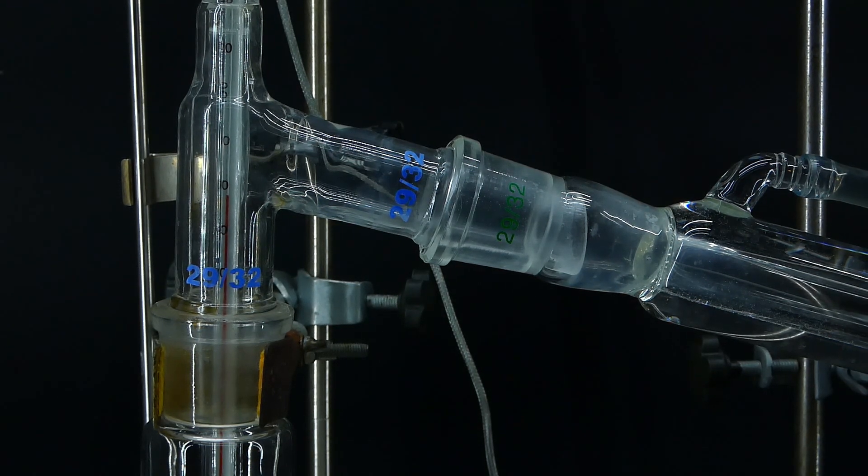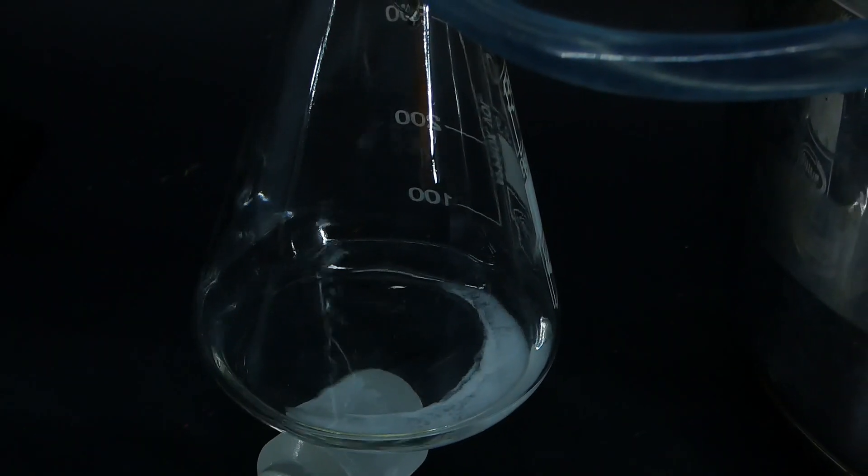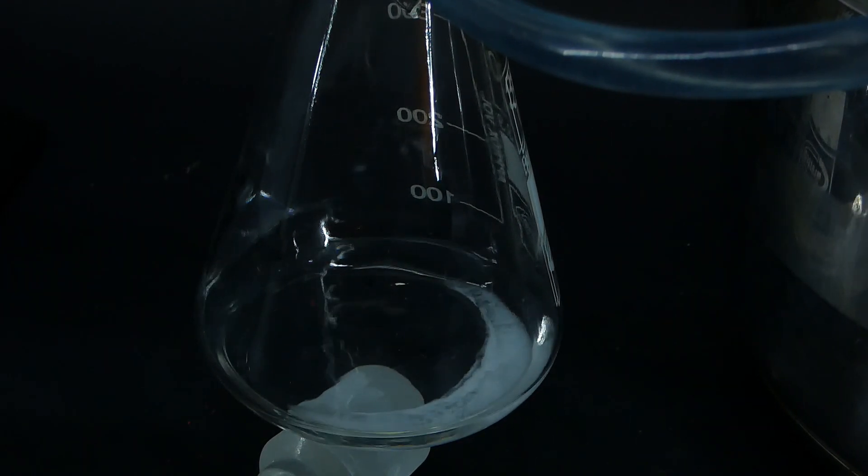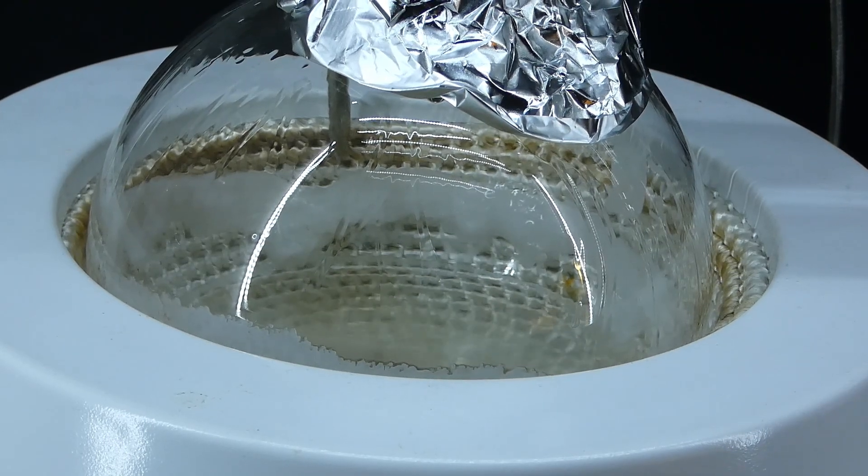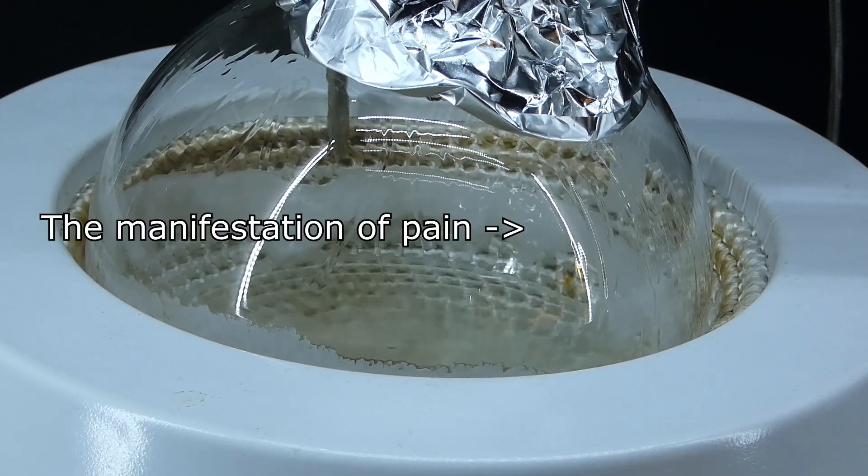It distilled over pretty quickly, and after a few minutes, I had a pretty nice amount of the distillate. In the boiling flask, some kind of white crust started to form, and it probably was just some unreacted boric acid, and by just looking at it, I knew that it would be a pain to clean.